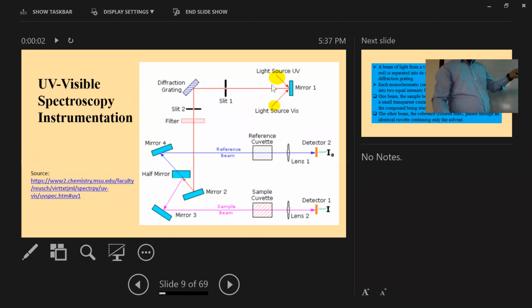From here the light goes this way. This is a mirror, you can see. If some light goes this way, it can reflect another way. If we put the light here on the mirror, you can see some light there.